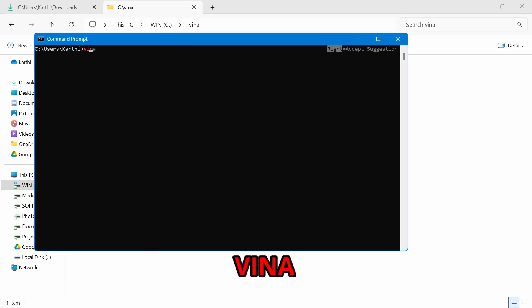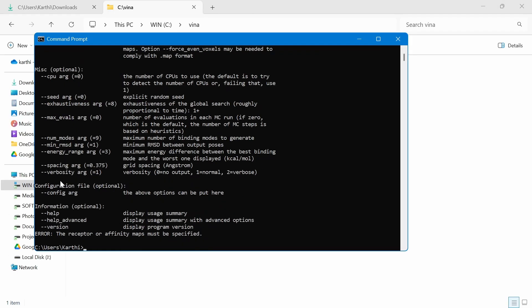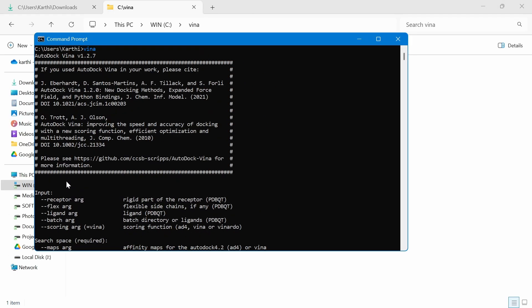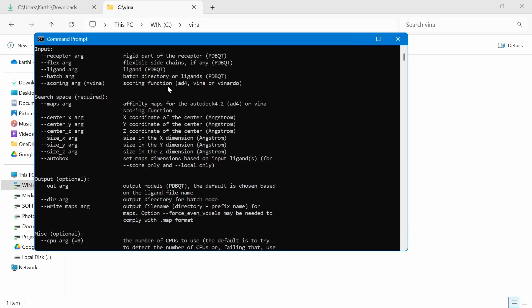Now open the command prompt and check for Vina. You can see Vina is successfully installed — you can see this help message. The version is 1.2.7. Now Vina is successfully installed and you can do virtual screening using it.